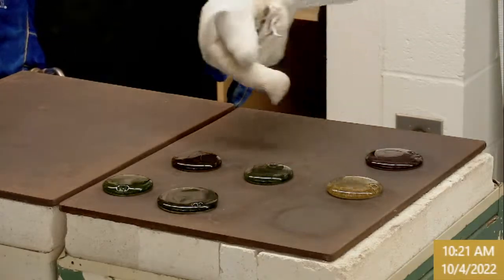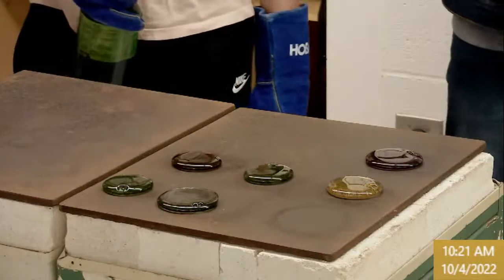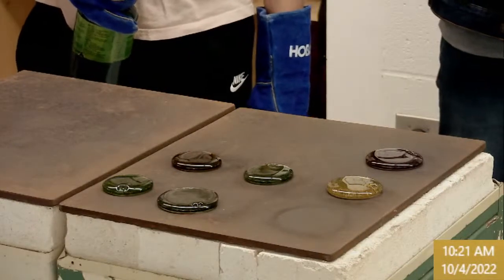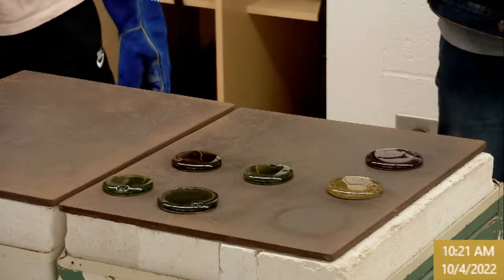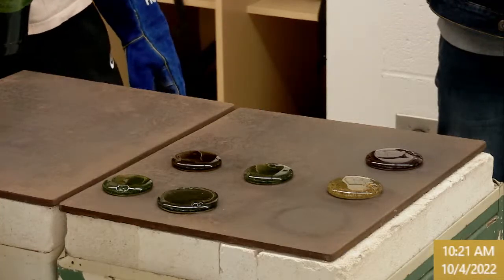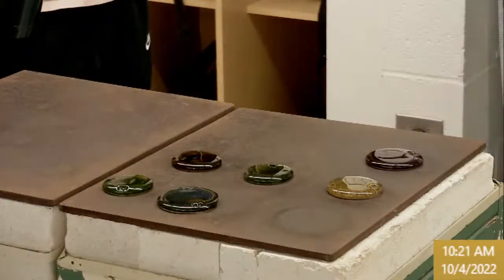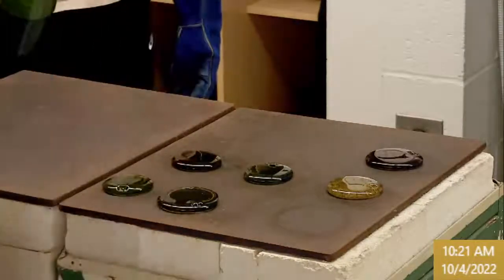So pour the next one right there, try to angle back this way. Maybe we'll move the crucible over here, even though it's a little toasty yet. Give you some room on the backside there. So, okay, next up we have H2.